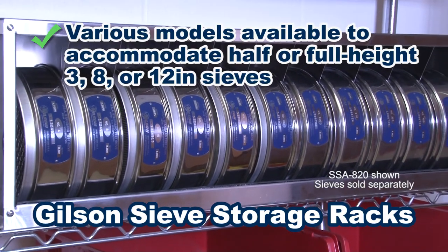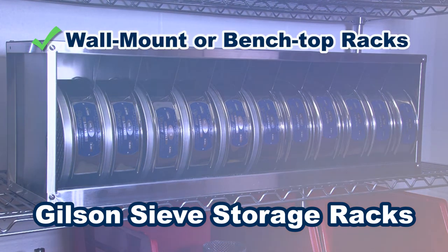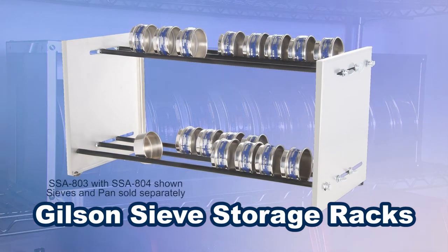Gilson's wall mounted or freestanding sieve storage racks are designed to easily store sieves, prevent sieve damage, and provide easy access to all your sieves.